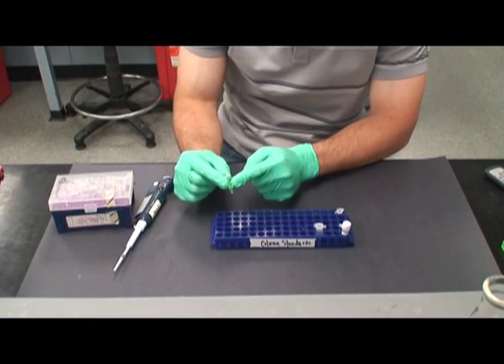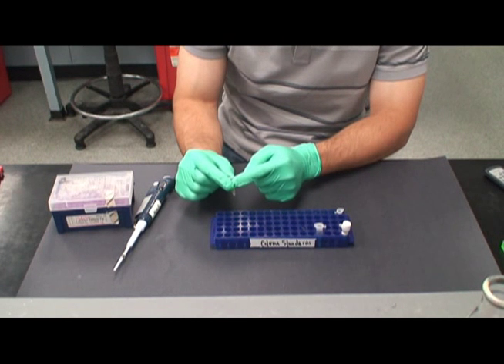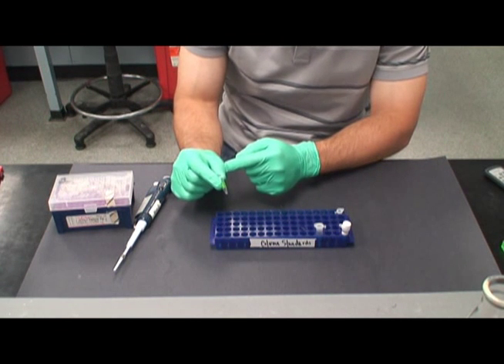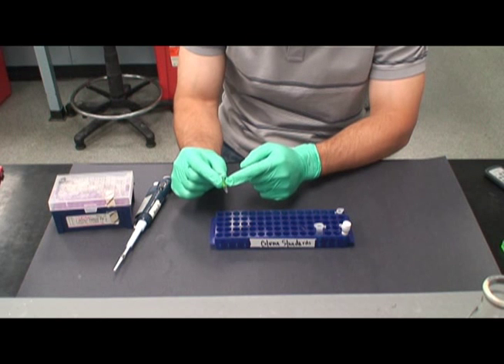A brief centrifuge will ensure that all the liquid is at the bottom of the tubes. The tubes are then incubated for 10 minutes at 37 degrees Celsius.